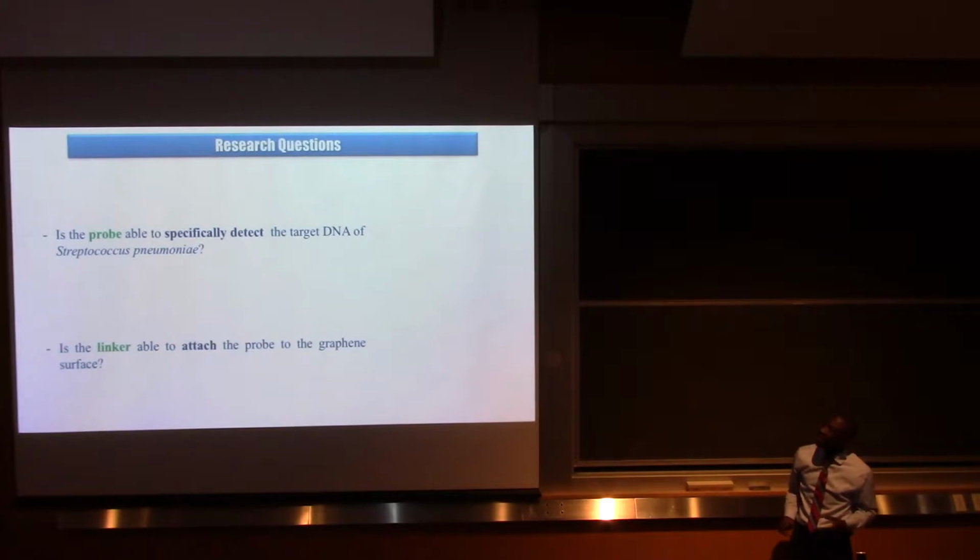So this brings us to my research questions. One, is the probe specific to detect the bacteria Streptococcus pneumoniae? Two, is the linker able to connect the probe onto the graphene surface?